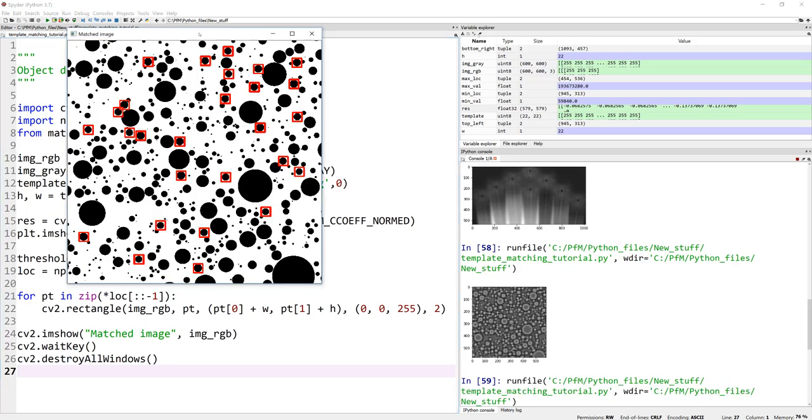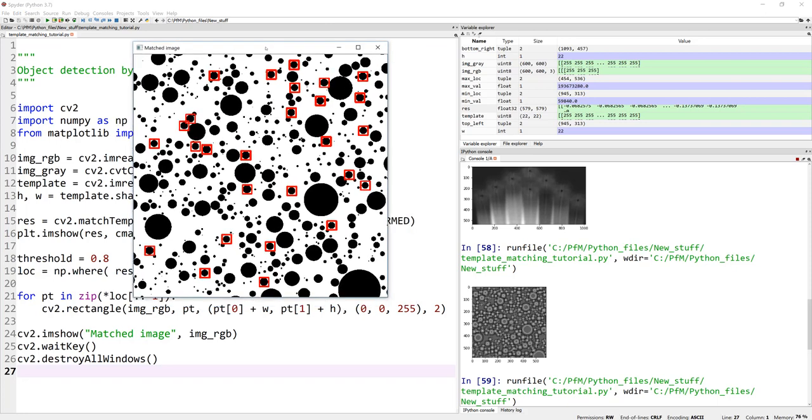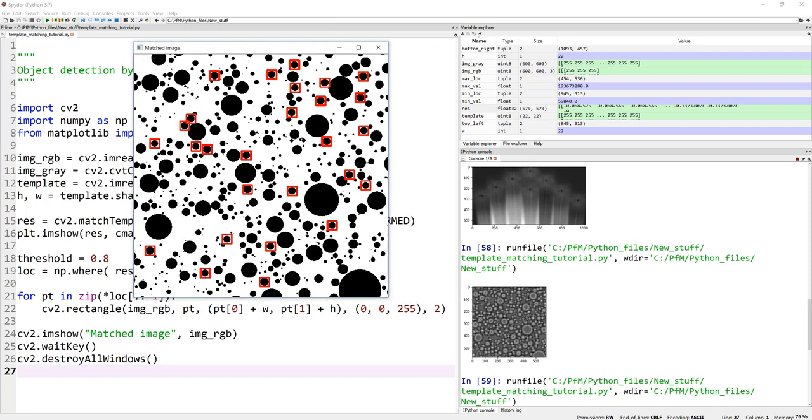So this is our output image where I picked the template of one of these. And as you can see, it's actually showing me all other, if you want to call them bubbles or nodules or inclusions, it's showing me the image, even though they are very close by, it's actually showing me all the regions where it actually matches within 0.8.